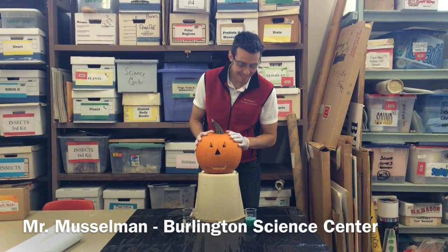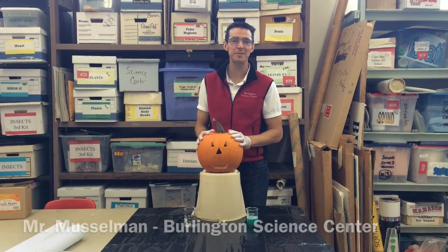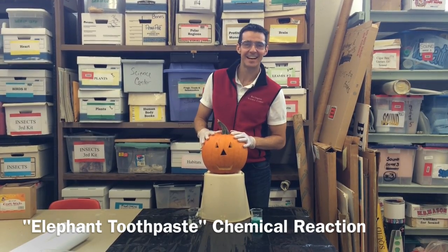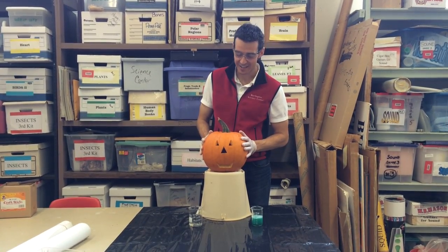Hi everyone from Musselman Science. Today we're going to perform a classic elephant toothpaste demonstration, but inside this jack-o-lantern.